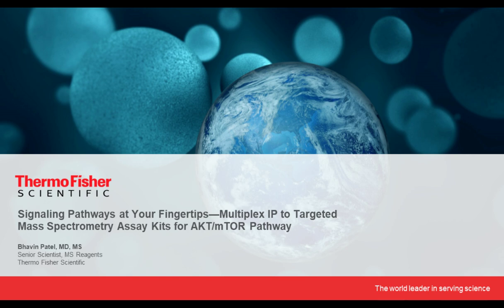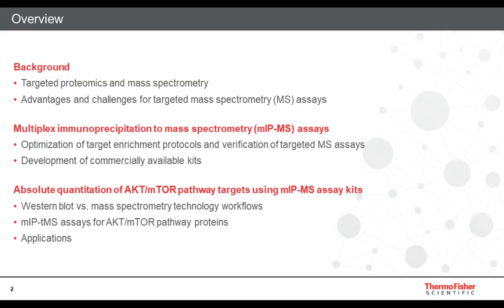So today we'll talk about the signaling pathways at your fingertips, Multiplex IP to Targeted Mass Spectrometry Assay Kits for the AKT mTOR signaling pathway. Just to give you an overview, I'll start out with background information on targeted proteomics and mass spectrometry, and also talk about the advantages and challenges for targeted mass spec assays.